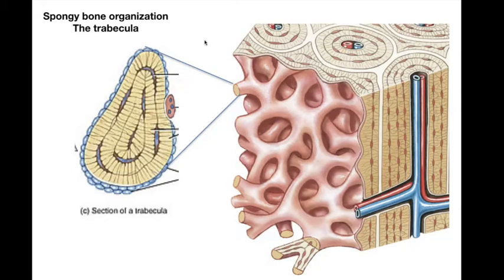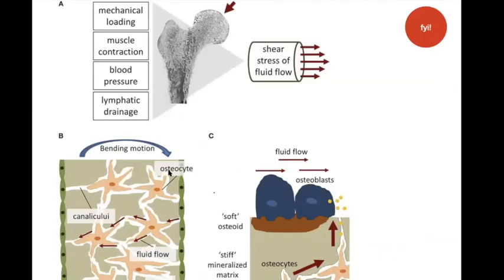All right, but the osteon, the functional unit here, has these rods going up and down, while here they have these struts called the trabecula making up the spongy bone. But otherwise, same stuff, right? Osteocytes and lacuna, canaliculi, even these little lamellae over here. All right, so I think that does it.